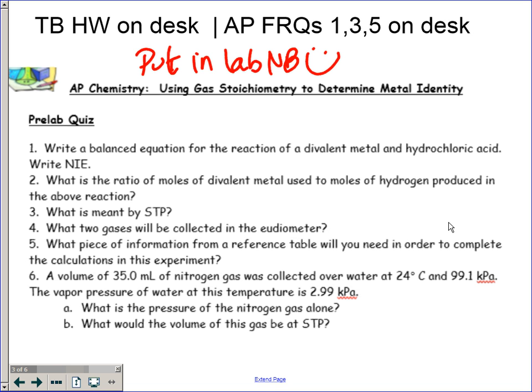Look in the lab. Don't be guessing. Look in the lab procedure. Sulfuric acid. Okay, so we are going to run both trials. It's not optional, okay, because we have large lab groups and we can kind of tag team on those. So this pre-lab specifically references hydrochloric, but you're going to be thinking the same way about sulfuric.